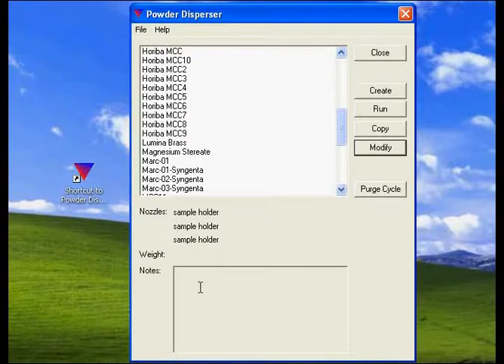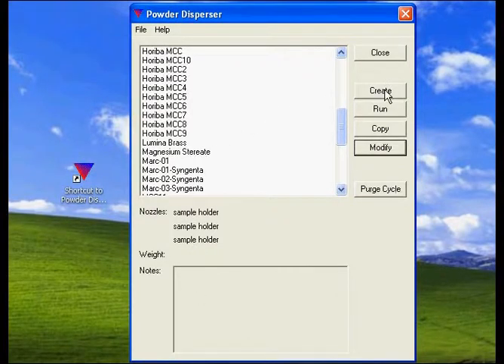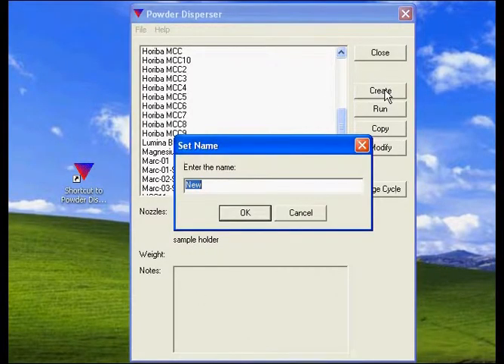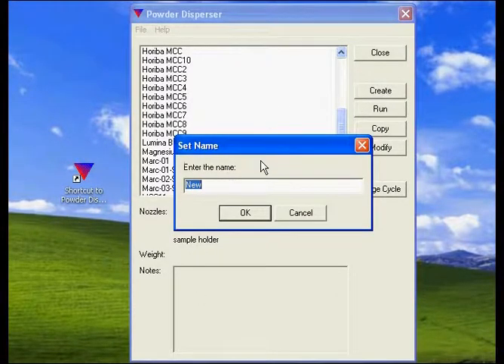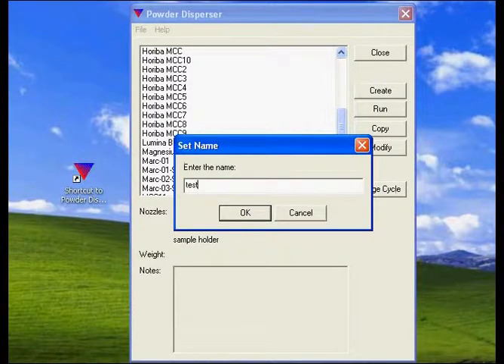In the software, the first step is to create a new test method. We were working on test dust.